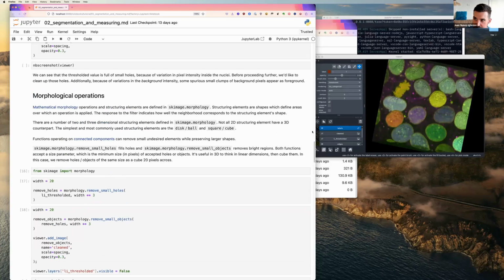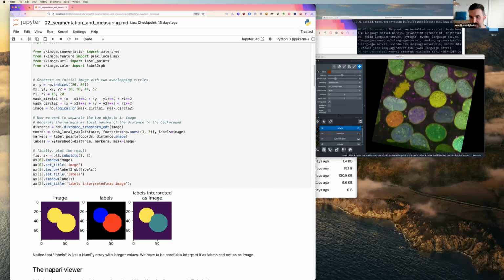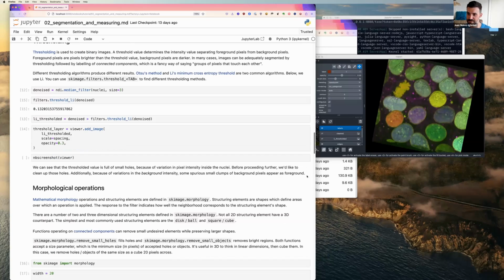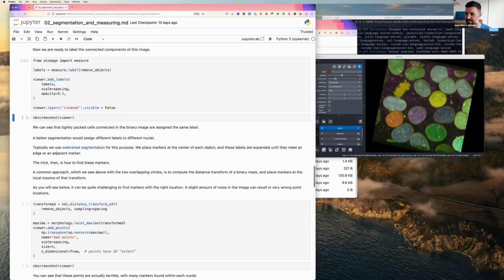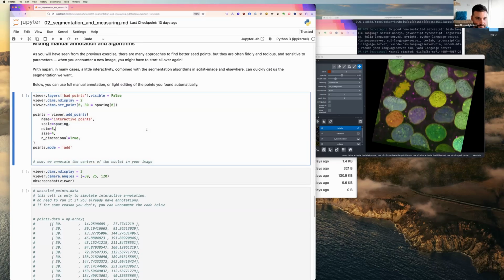So we're going to do the same thing that we did for our blobs up here, which is to run a watershed. And unfortunately, we're low on time, so I'm not going to go over the watershed algorithm, only to say that what you're doing is you're placing markers in the middle of each nucleus, and then you're doing a flood. You're flooding the pixel values until you find an edge, or until you run into some other flooding. So we need to put markers over here, over here, over here, and then start flooding, and then that will define our different nuclei.